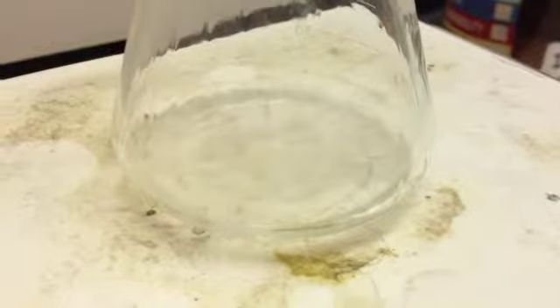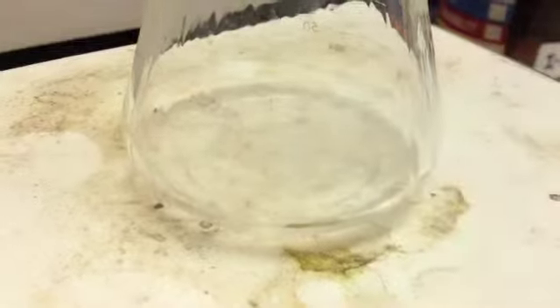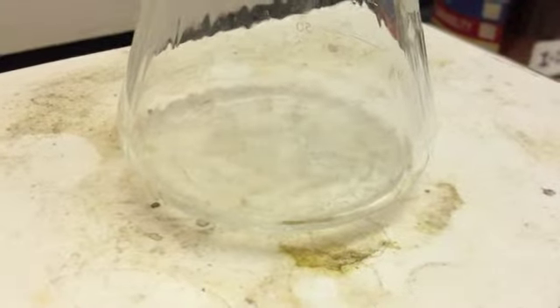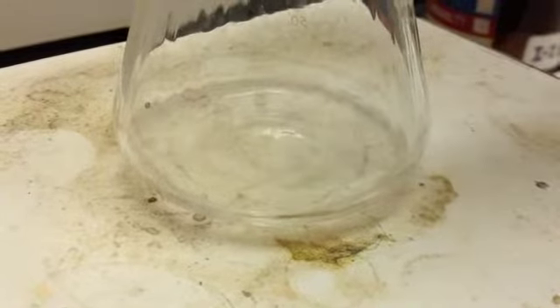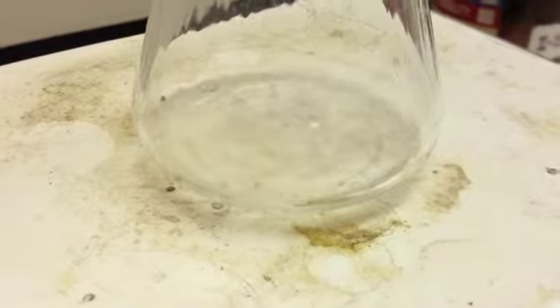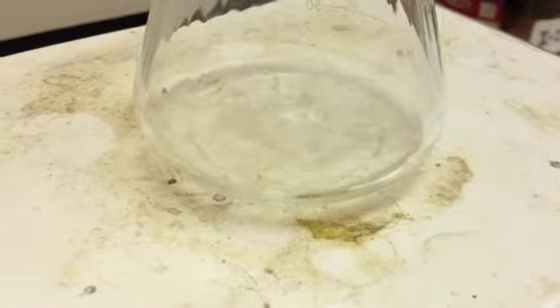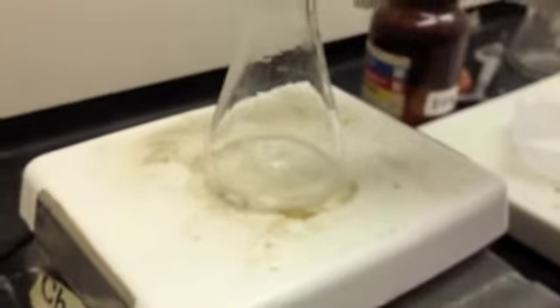Okay, so I turned up the hot plate just a little bit, and as you can see the ethanol is starting to boil. You want it to boil off just a little bit. Remember not to let it boil off too quickly, otherwise it might flash. In this case we don't have too much solvent in there, so it's okay. But if you have more, you don't want to heat it up as fast. So I think this is probably enough now. So we're going to let this cool to room temperature. So let's move over to the lab bench.